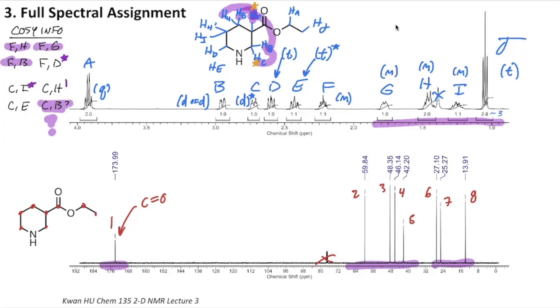It's also pretty far away from H. We wouldn't expect to see coupling there. And it's pretty far away from E as well. Proton E is here. Somehow its little bond got erased. But normally we wouldn't see this kind of coupling across a heteroatom like that. The heteroatoms can sometimes disrupt the coupling. So we wouldn't necessarily expect to see that one. Even if we did, we're still only at 50% of these cross peaks making sense. So I think C is probably not in the right spot.